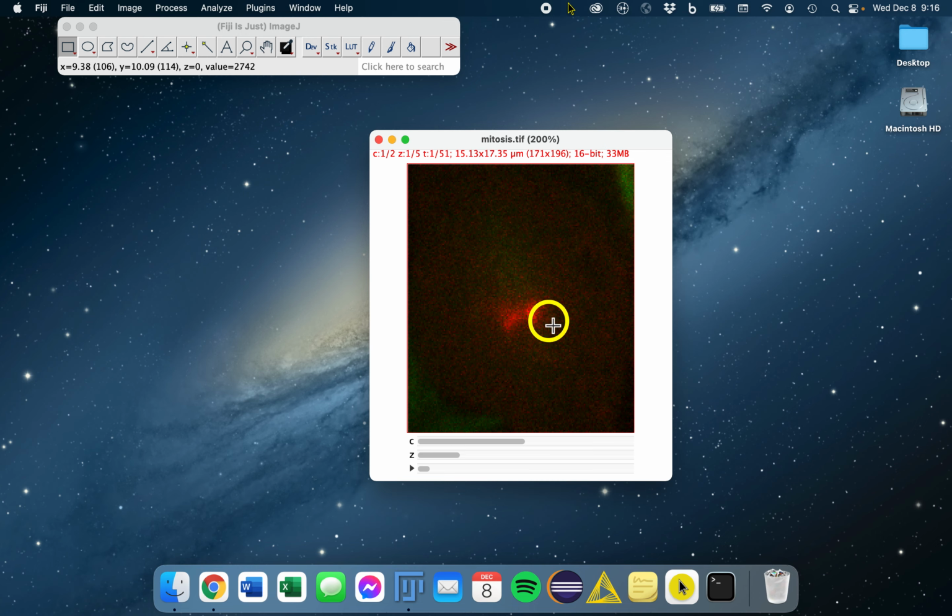So there are 3 types of gray value images that ImageJ uses, which are 8-bit, 16-bit, and then there's a 32-bit floating point. So that refers to real numbers. So a 32-bit image is an image made up of real numbers, and it also allows for negative values. So a 32-bit image is good if you're subtracting, for example, one image from another. Otherwise, you'll clip your data set, your numbers at 0.